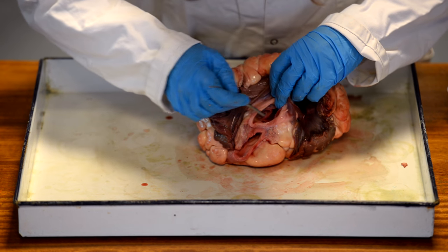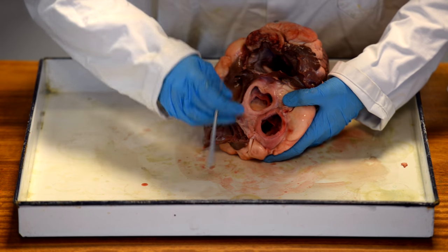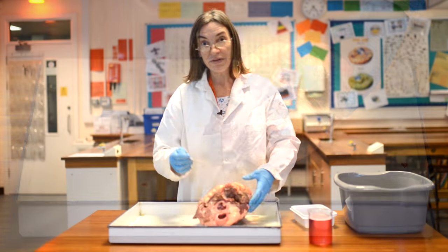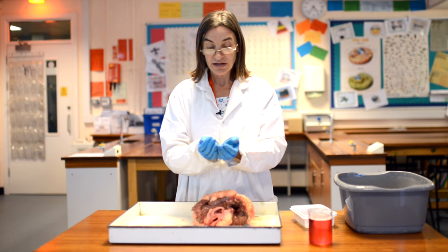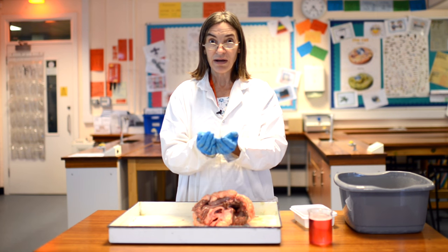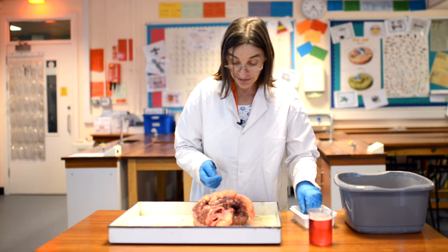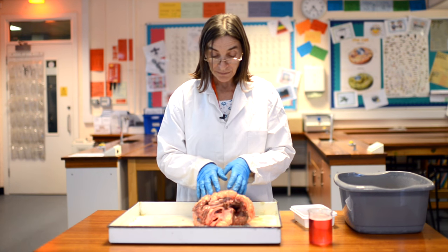See these pockets? And you have a valve on this blood vessel, again with pockets. So in between beats of the heart, the blood gathers in the pockets, they come together and stop the back flow of blood. There are other valves which we'll see when we get inside. So let's have a little look and think about what's going on here.